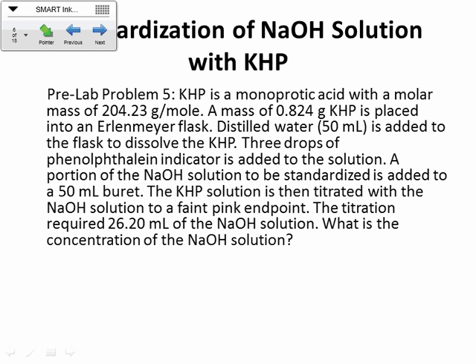All right, KHP, potassium hydrogen phthalate. That's a hard word to say. It's phthalate.